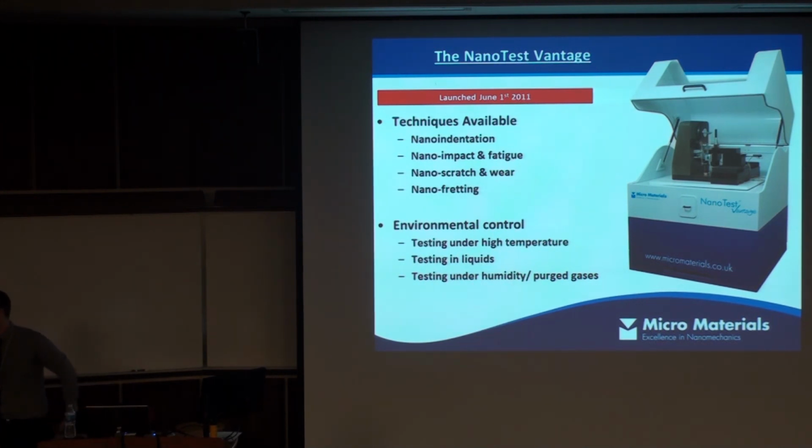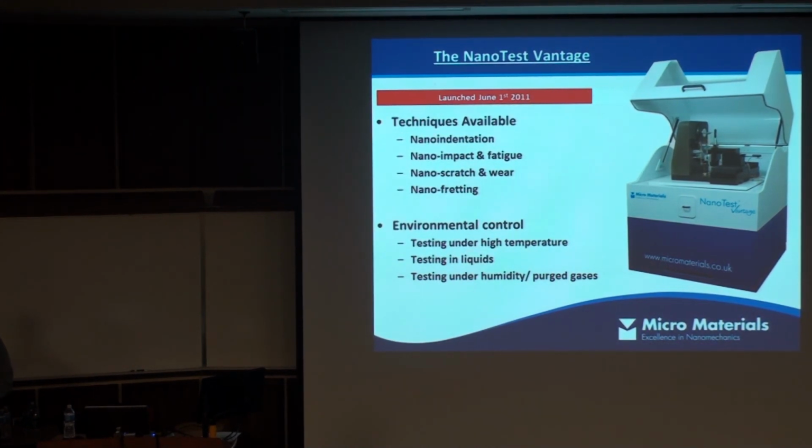So the fracture, I was trying to understand this. You're actually presenting the probability of having a fracture event. Yes, that's what you're looking at. Yeah, so there'll be slight variations in the structure across the surface, so you're never going to get a uniform failure. Right, so it's easier to look at the percentage, the chance of actually driving a failure. So it tends to work quite well as a categorization tool for different coatings.